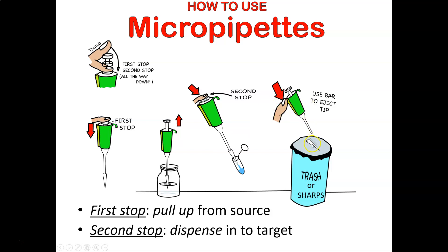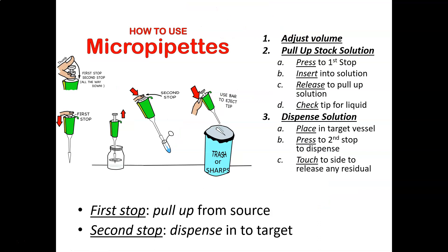Then eject the tip into the sharps or trash can. If you're pipetting water into a non-dangerous reagent, the tip can go in the trash. But if you're pipetting blood, that pipette tip is contaminated. It's not soft, so even though it's not especially sharp, it has to go in the sharps — because it's a biohazard. You must use a new tip each time to avoid cross-contamination. Pipetting is a little bit of an art, but you get the hang of it after a few minutes.